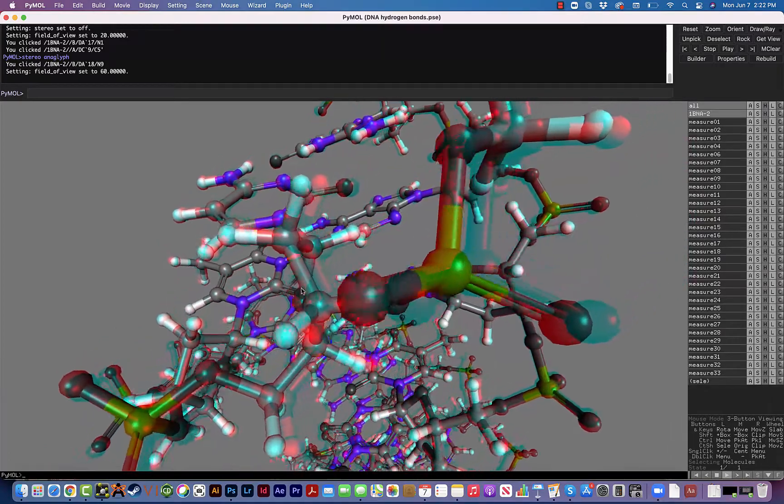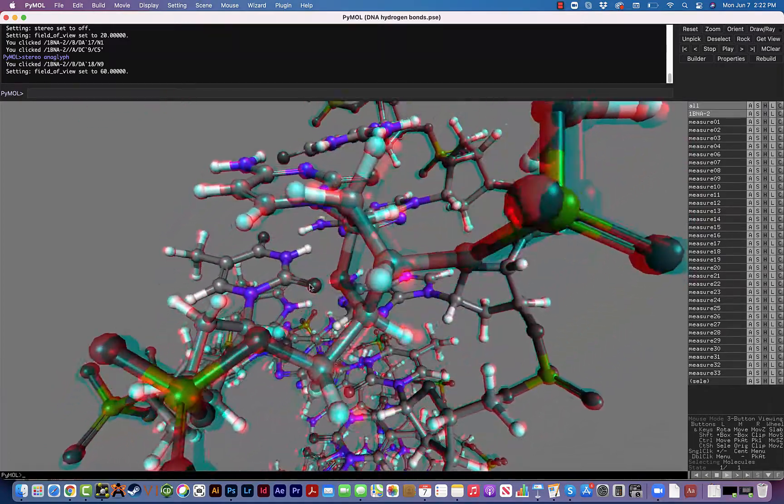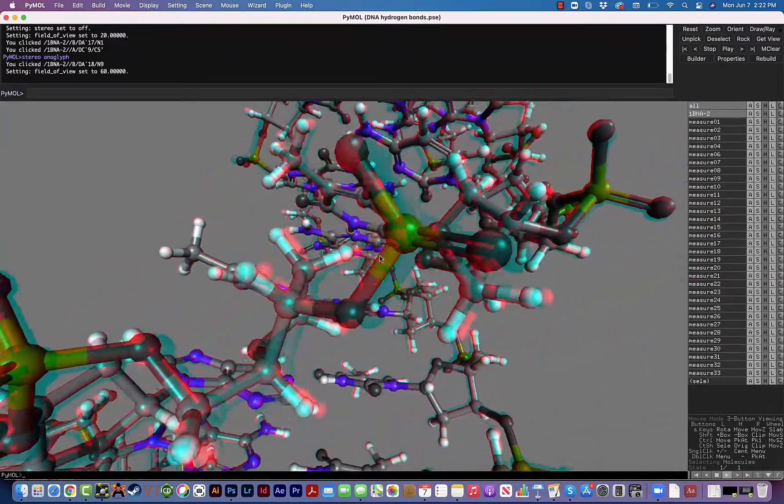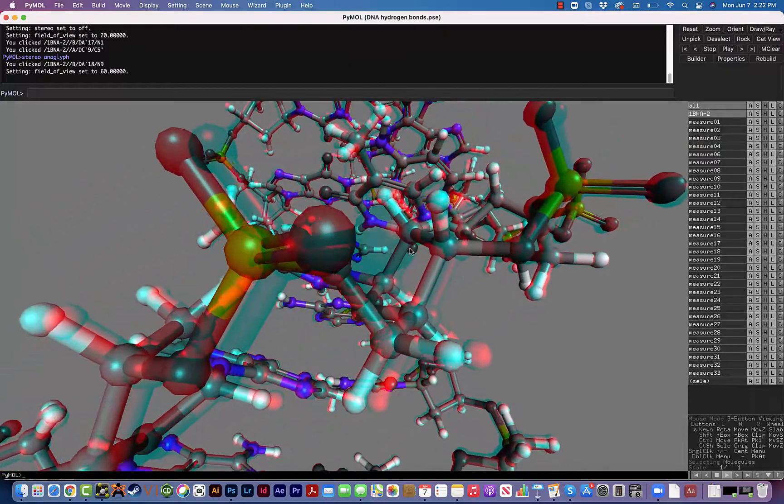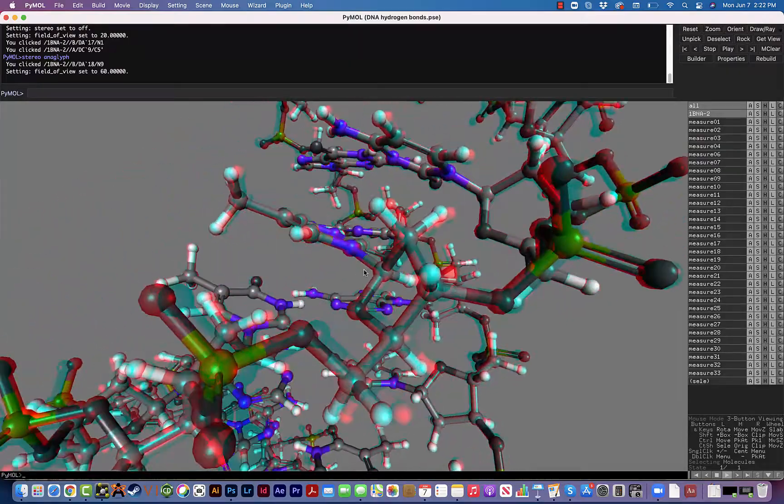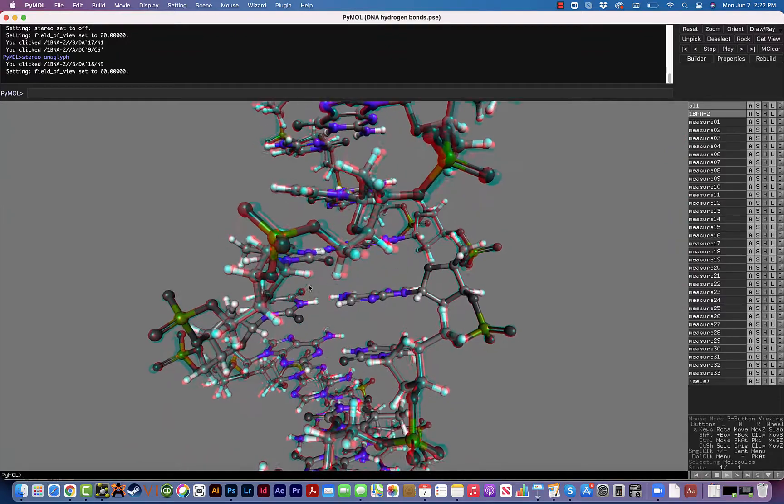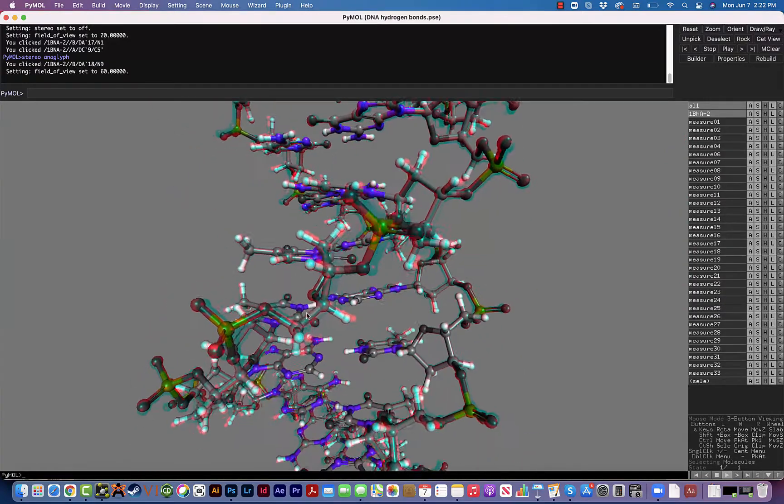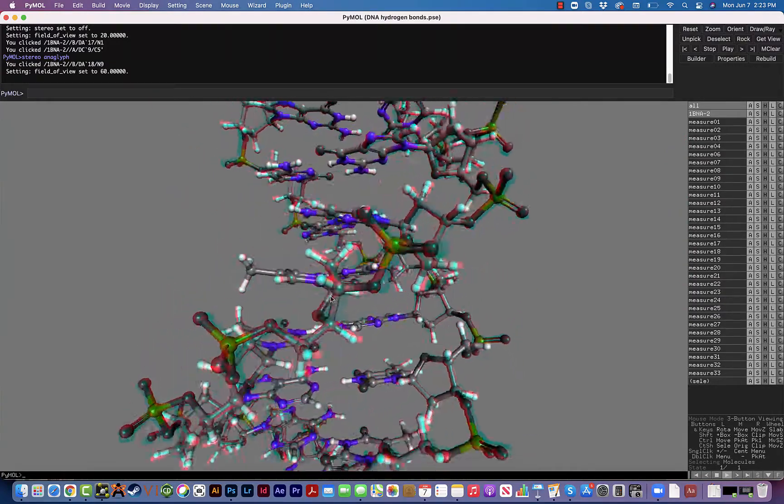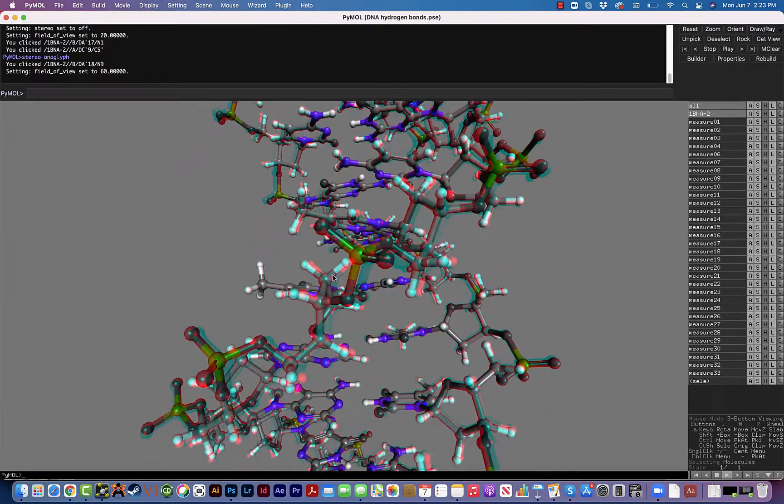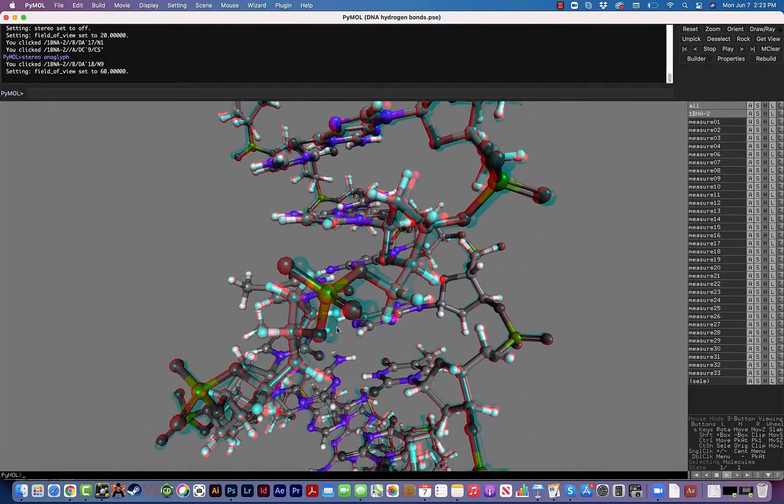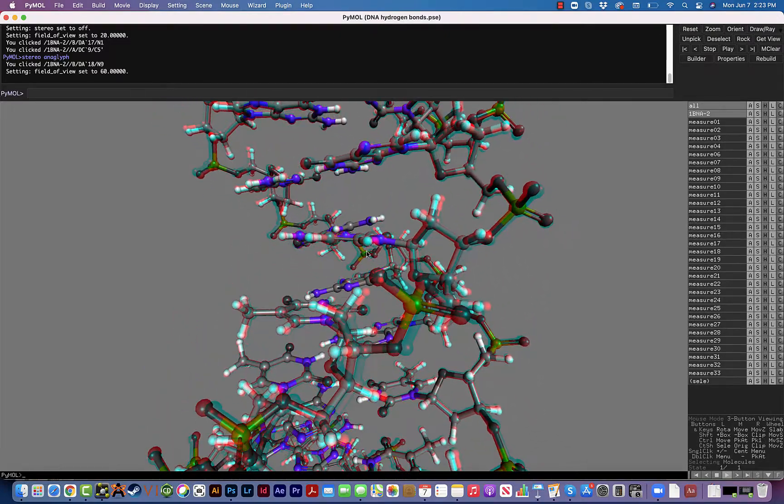So now the phosphate backbone of the DNA is really exaggerated, kind of jumping out at you, and if you're wearing the 3D glasses it's very cool to see that. Now you can do this with any structure in Pymol as far as I know, so feel free to use this once in a while when you are viewing Pymol structures.